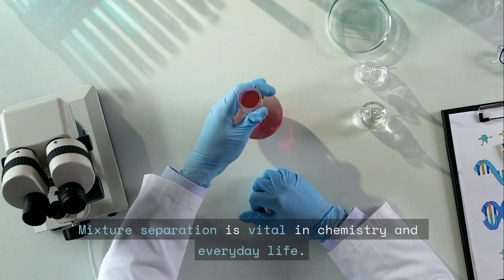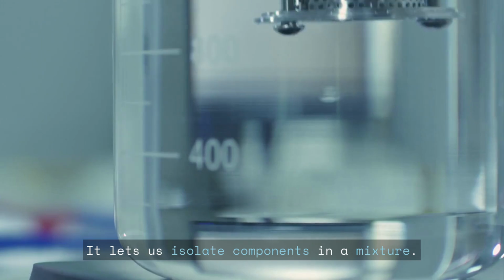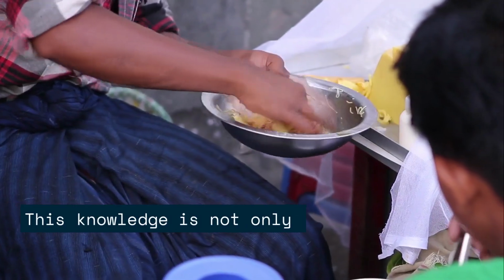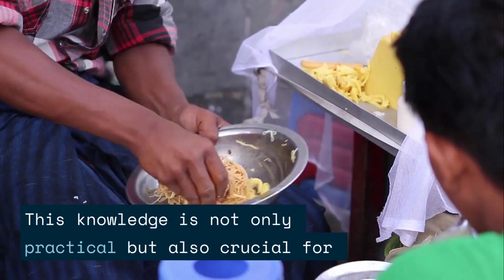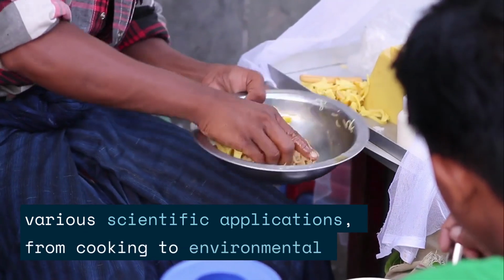Mixture separation is vital in chemistry and everyday life. It lets us isolate components in a mixture. This knowledge is not only practical but also crucial for various scientific applications, from cooking to environmental safety.